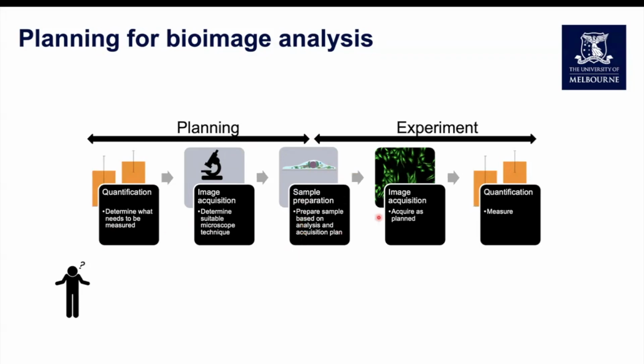Once we have the sample, we can acquire the data. Again, this may change depending on what quantification you require, in terms of your instrument settings and acquisition settings. And then finally, we can work on actually measuring that data.